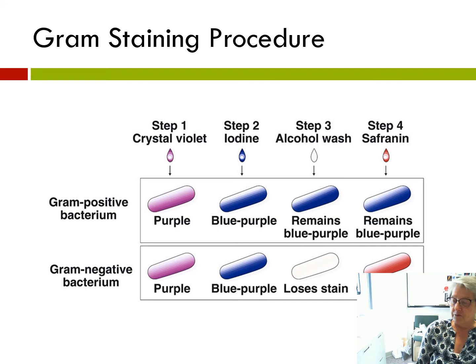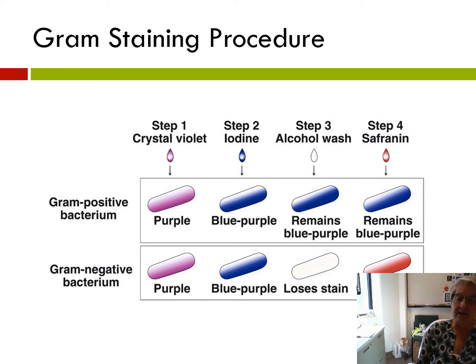After another rinse with water, you add the counter stain, safranin. The safranin now stains the gram-negative bacteria a reddish pink color. And after a final water rinse, the bacteria are now ready for viewing under the microscope.